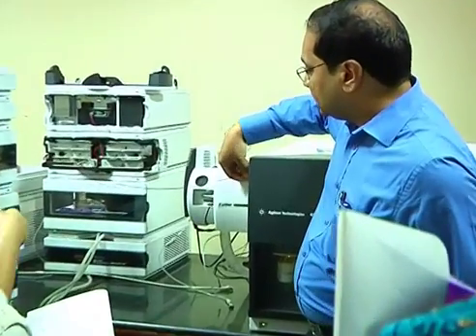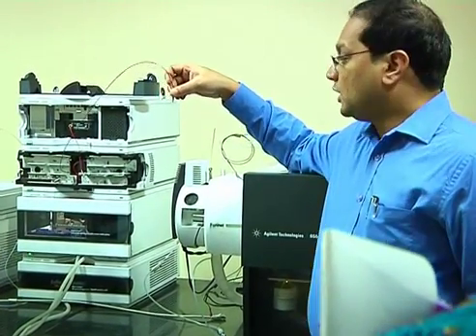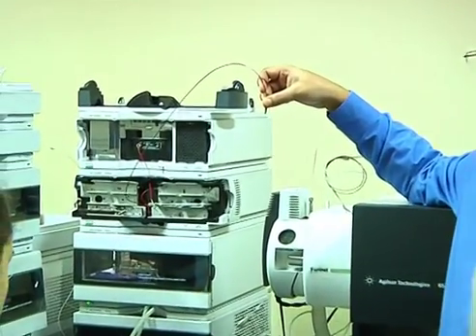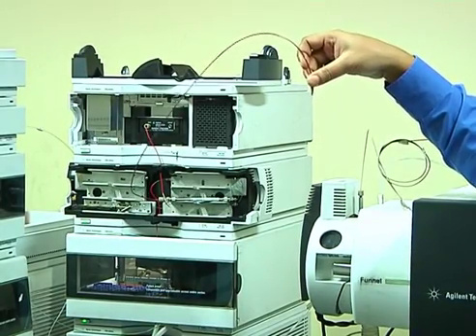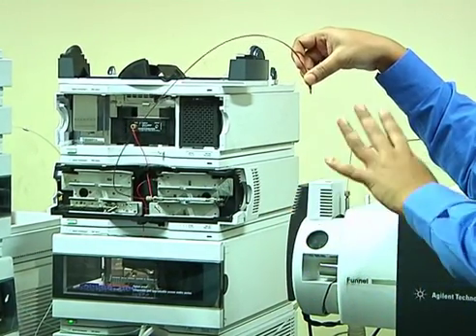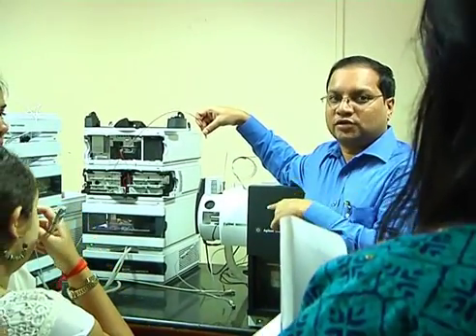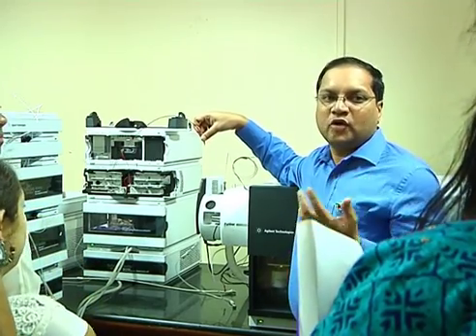As I told you, it runs through the column and then elutes in the form of liquid like this. Right now the method is running at a flow rate of 0.4 ml per minute. You can go to 1 ml per minute, but with this source only; I am not going into the details of the source specification. For other MS sources in general, you may not be able to go beyond 0.5.